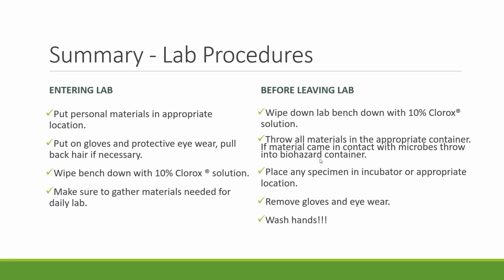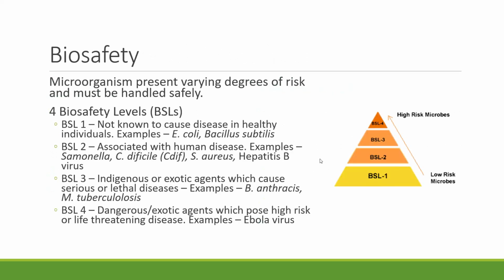Then students are to remove their gloves using the proper technique, inside out. They put their eyewear up, and we put those into a UV container so that they can be sterilized. Then they have to wash their hands, grab their personal materials, and then you get to leave. So again, that's just going through what would happen if you were in what we call a wet lab, or a live physical lab.